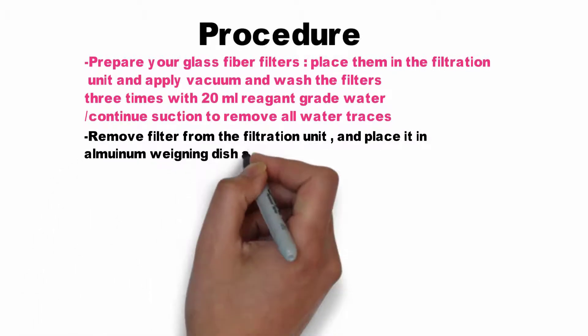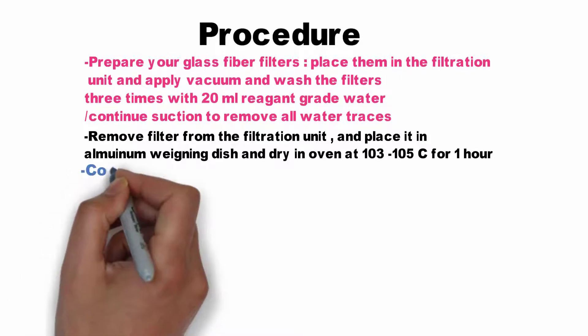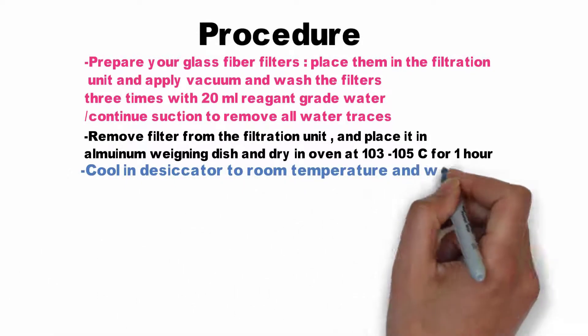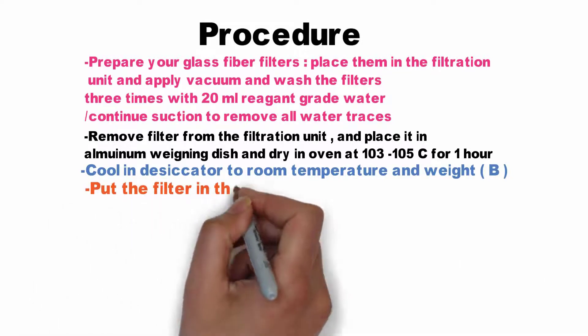Place it in the aluminum weighing dish and dry it in the oven at 103 to 105 degrees Celsius for one hour. After that, cool it in a desiccator to room temperature and take the initial weight.